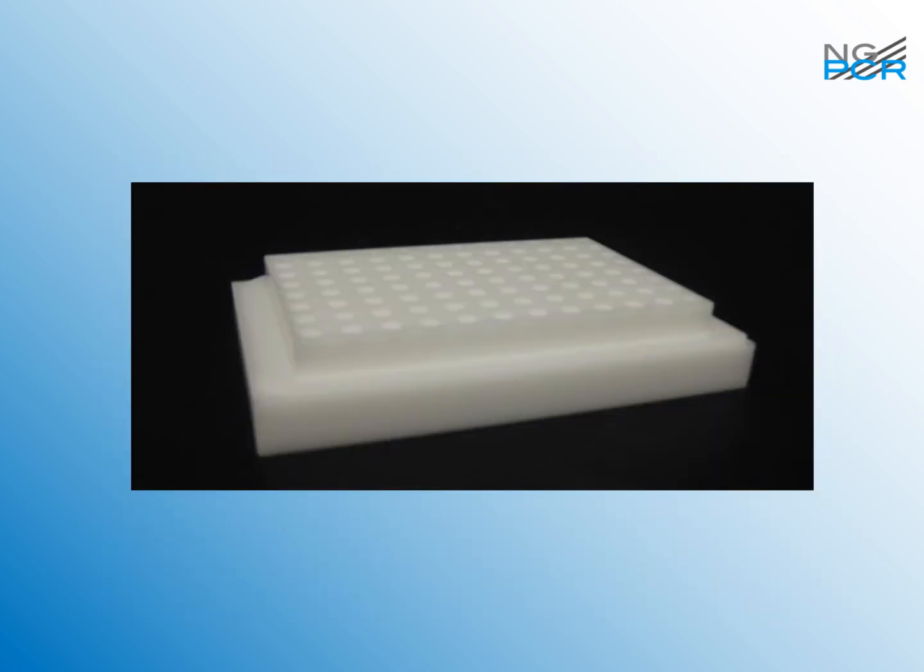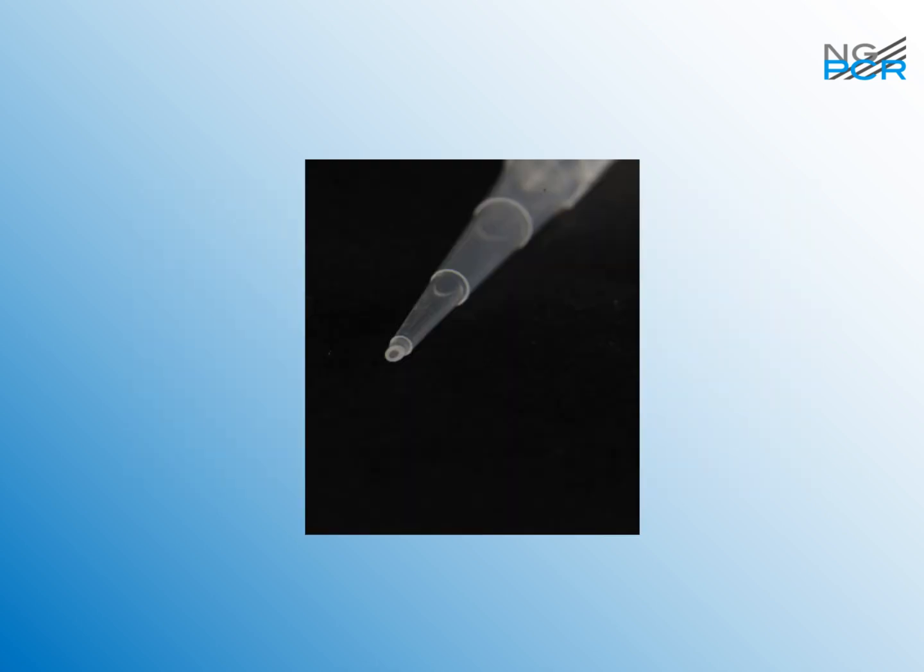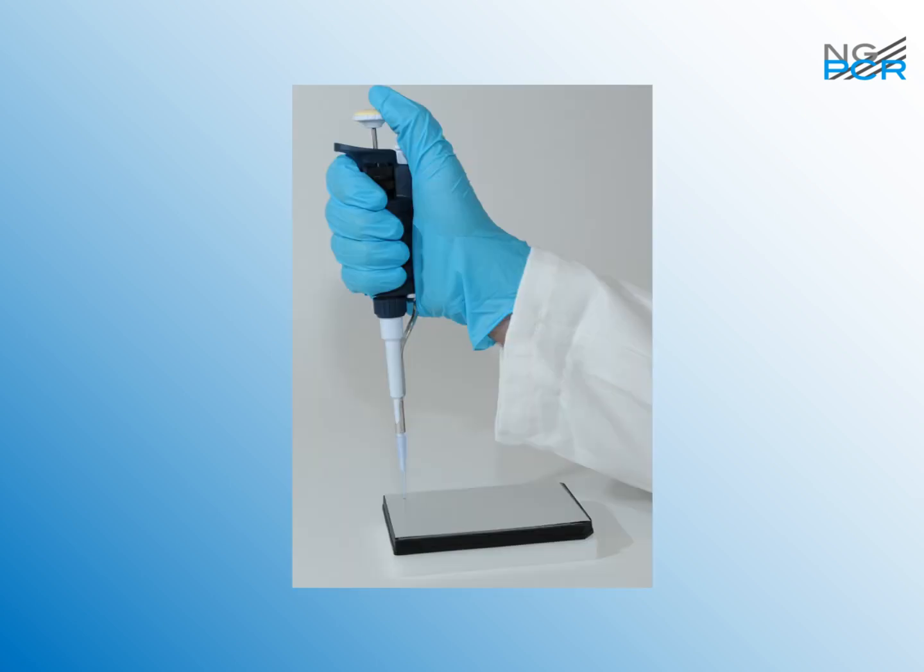And then this you will recognize from an earlier slide as the pipetting anvil, and we also use that to retrieve the PCR products from the plate. And we do that using this specific tip. This is still a polypropylene pipette tip, but as you can see here at the end, it's cut off at 30 degrees. So it's really sharp. It's sharp like a needle. And what we do with this is simply stick through the seal, the heat seal.